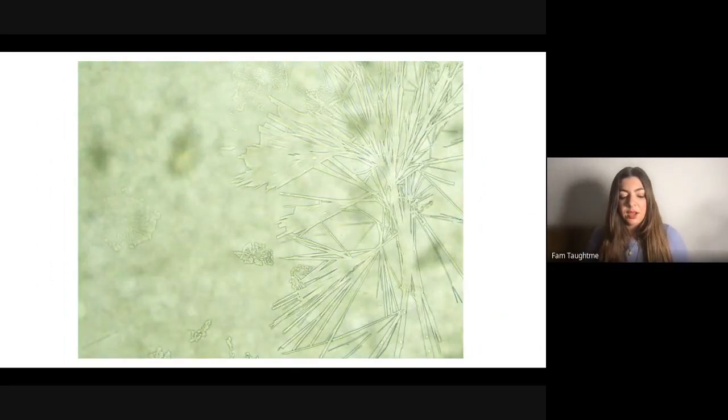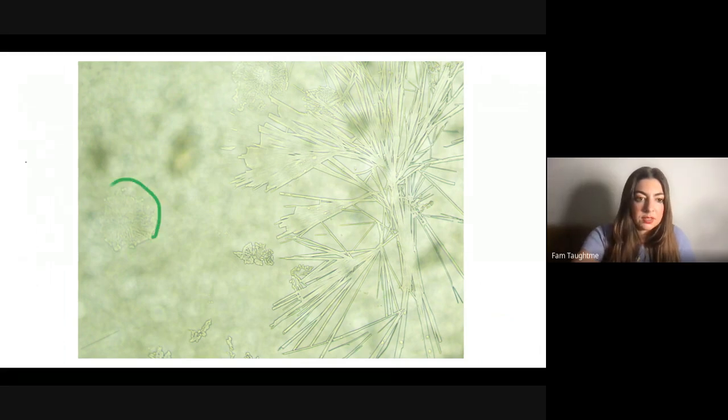And actually on my second round, on my very last day, so cycle day 29 of the second cycle that I experimented with, I saw this observation, which if you notice those really intricate, beautiful ferns that we saw, they were these, like this size here.